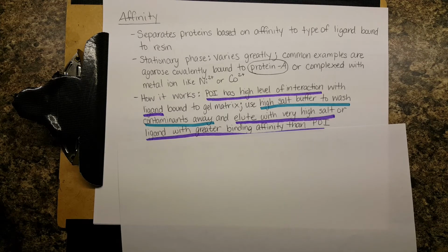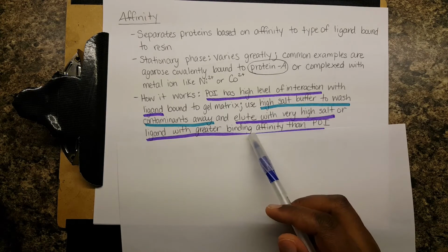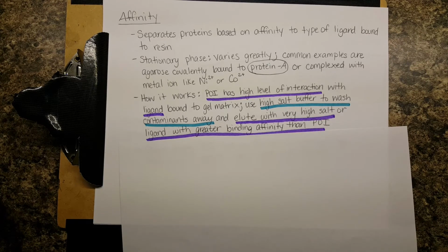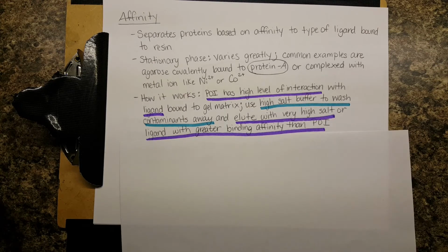your protein of interest. So in the case of protein A, you're going to use a protein ligand that will replace your POI. Instead of your POI being bound, it will be the ligand, and it'll flow through the column. The high salt will interrupt interactions. So very high salt concentrations will force your protein of interest off the column.